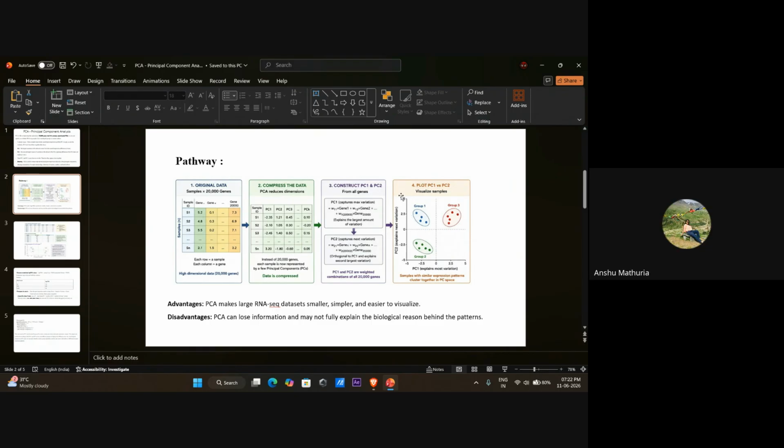In RNA-seq, we are basically taking the log CPM values, and from that we are calculating, right? Yes, ma'am. Before this question, I want to ask one more: can you plot PCA for any other computational analysis as well, or just RNA-seq? We can plot for any other, ma'am.